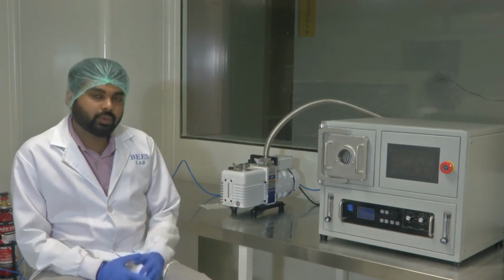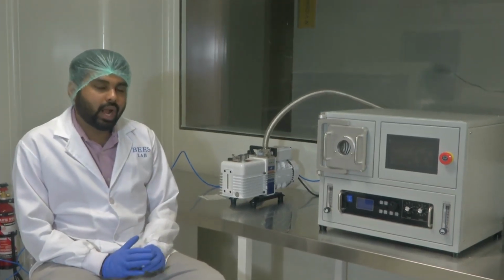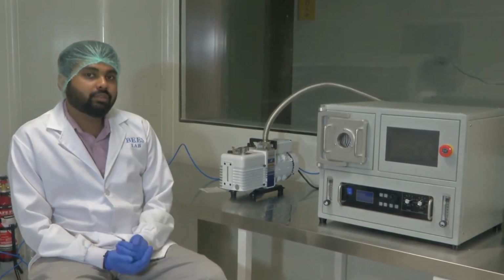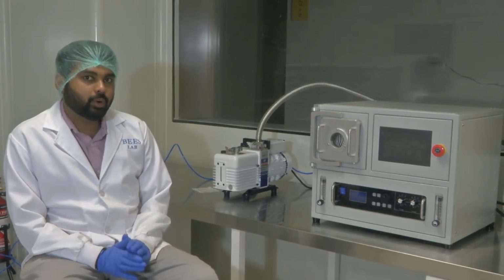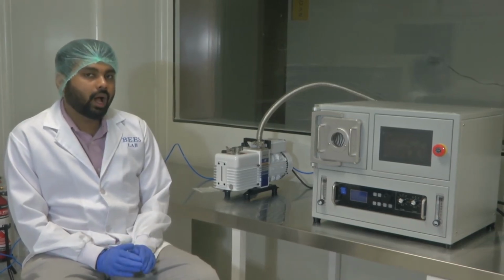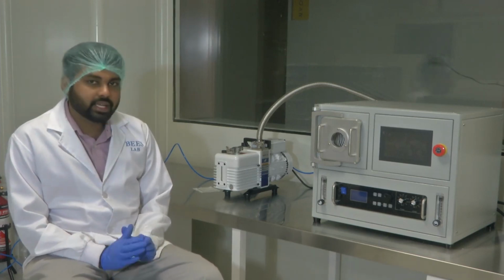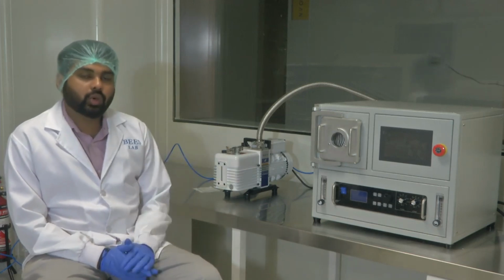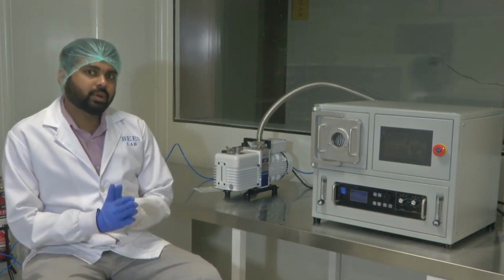You might be thinking why we are going into this. Before you understand any system, especially systems that deal with vacuum, you should understand the basics of whatever components are there in the system, even if it may not be required for your day-to-day operation with the system. This is because you should be able to troubleshoot if some issue comes up, know the reason behind it happening, and be able to fix it. These are all very safety regulated systems. You have to be very careful in handling them, and we are handling oxygen also. It is an explosive gas, so you have to be extremely careful while handling.